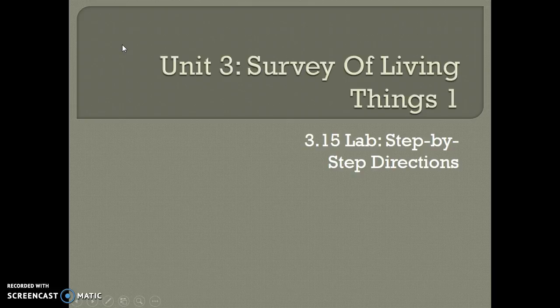This Friday, March 17th, you will be starting your lab on human digestion. I am coming to you with some step-by-step instructions, and I'm going to show you how to complete this lab. It is not the easiest lab to work through, so I wanted to give you a visual of what you will be doing and talk you through the lab.